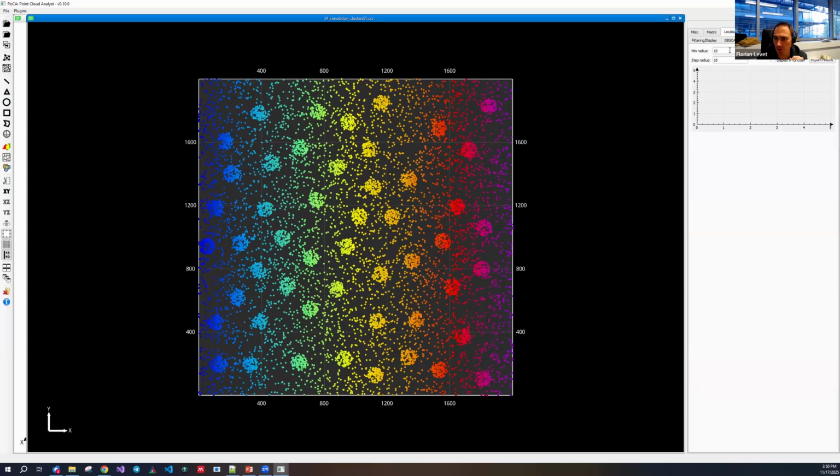So for instance, between 50 and 200 nanometers, every 10 nanometers, and then you can compute the curve. As you can see, this is a Ripley K here. So this one, you cannot really manage to understand it. But if you go to the H Ripley, you can see here that you have a maximum at around 60 nanometers in this case. And then you can export your result if you want.